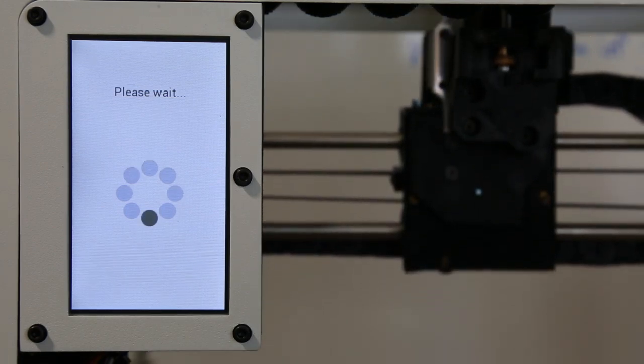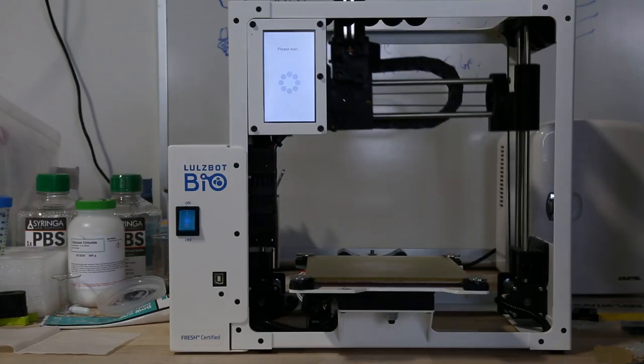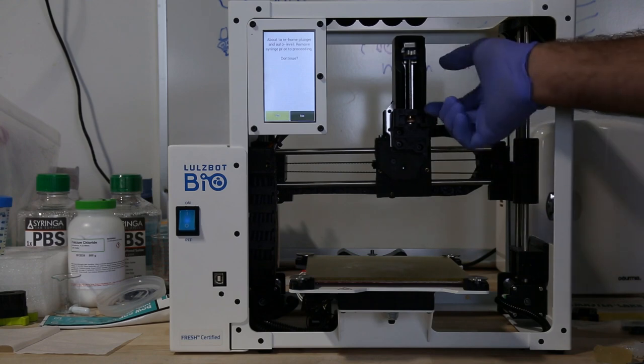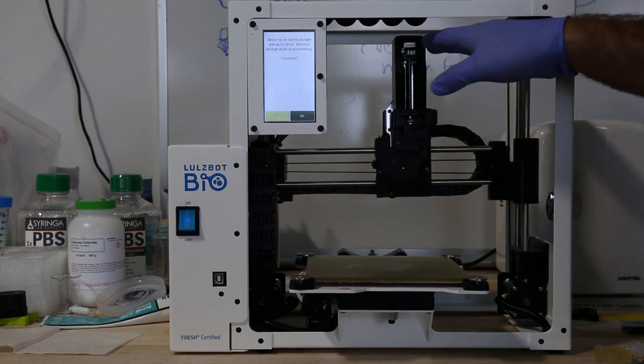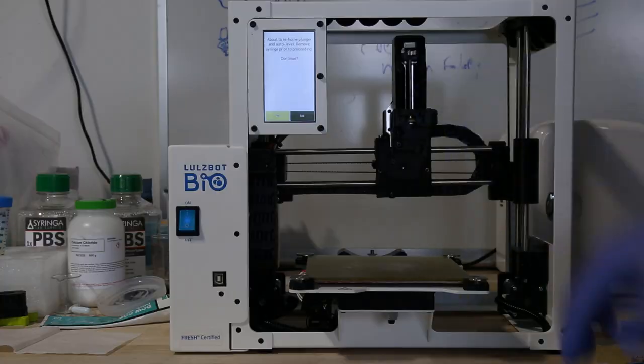And now the carriage is gonna move to the syringe unload or load position. Now if you had a syringe in here you would remove it. After that the machine is gonna level the X gantry and home the plunger to the top.